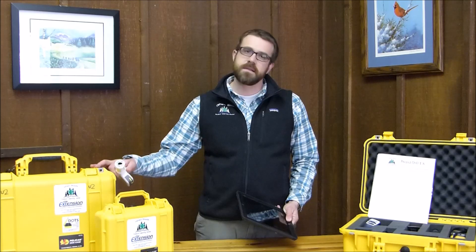Today we're going to take a look at a wireless microscope. This wireless microscope is included in our DOTS kit, it's included in our programming at Upham Woods, and the outreach that we support in environmental education.